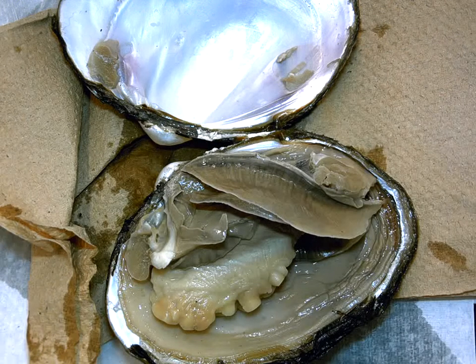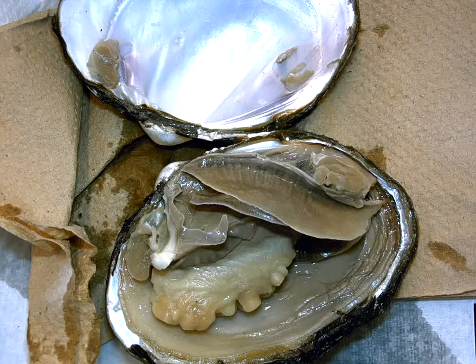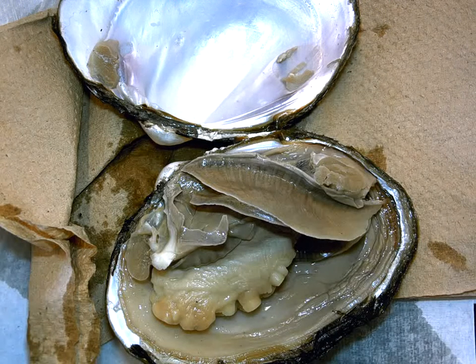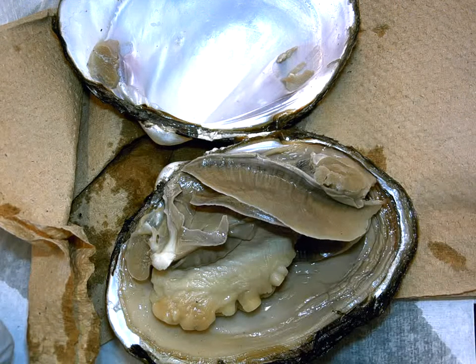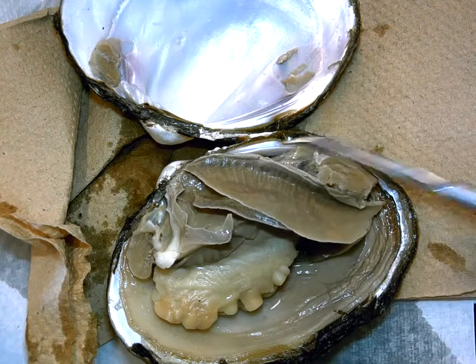We're now at the circulatory system section of the lab. The first thing in the circulatory system it's going to ask you to look at is that the heart is situated up against the hinge of the shell, in a very dorsal location.